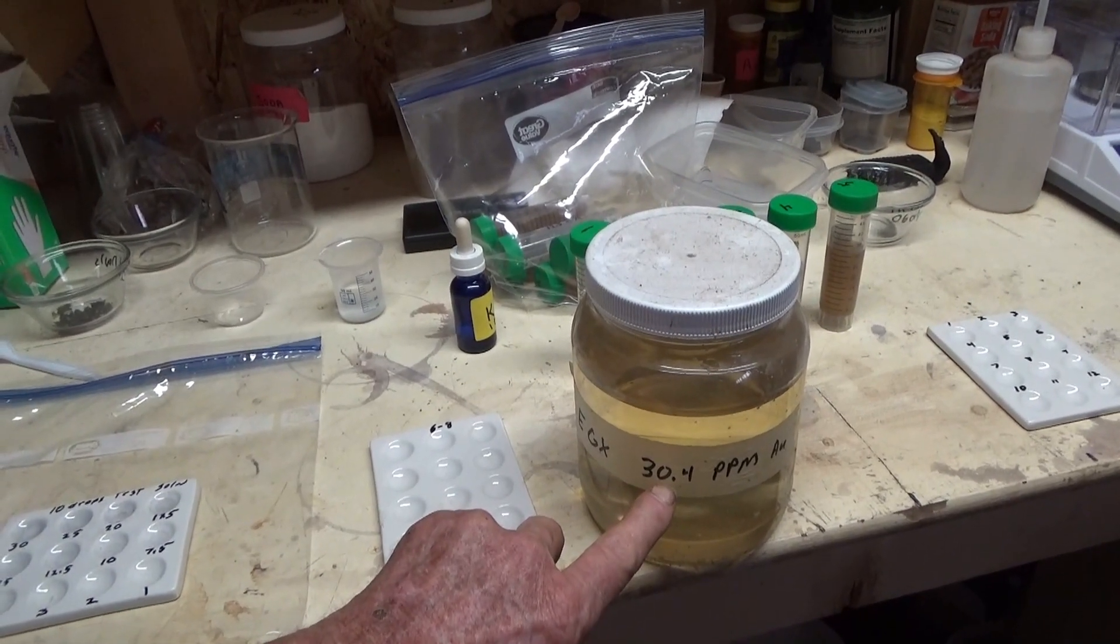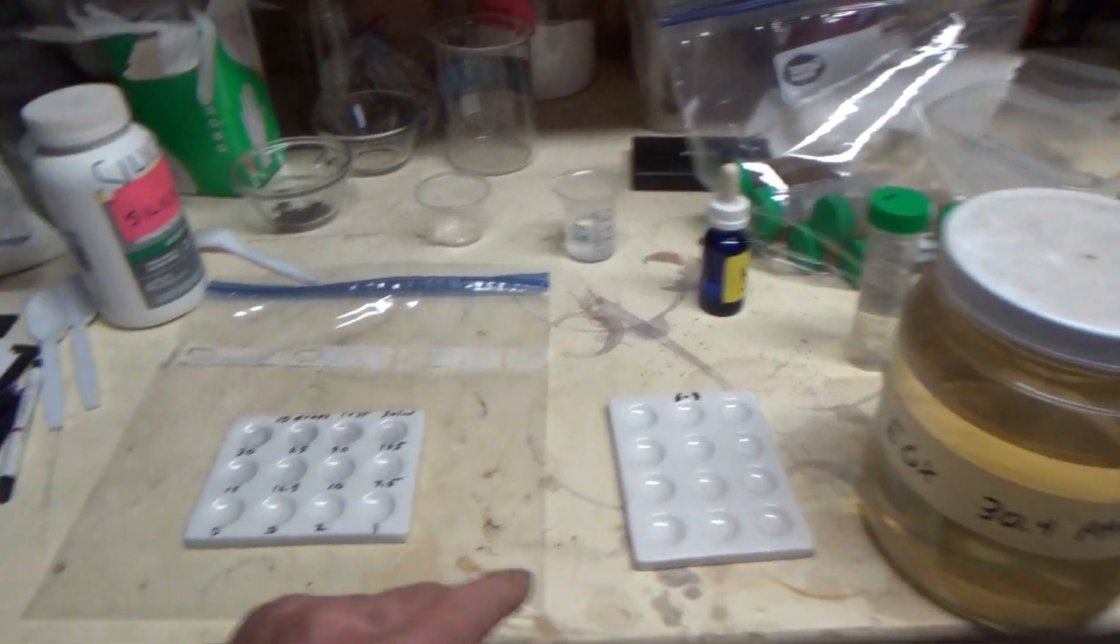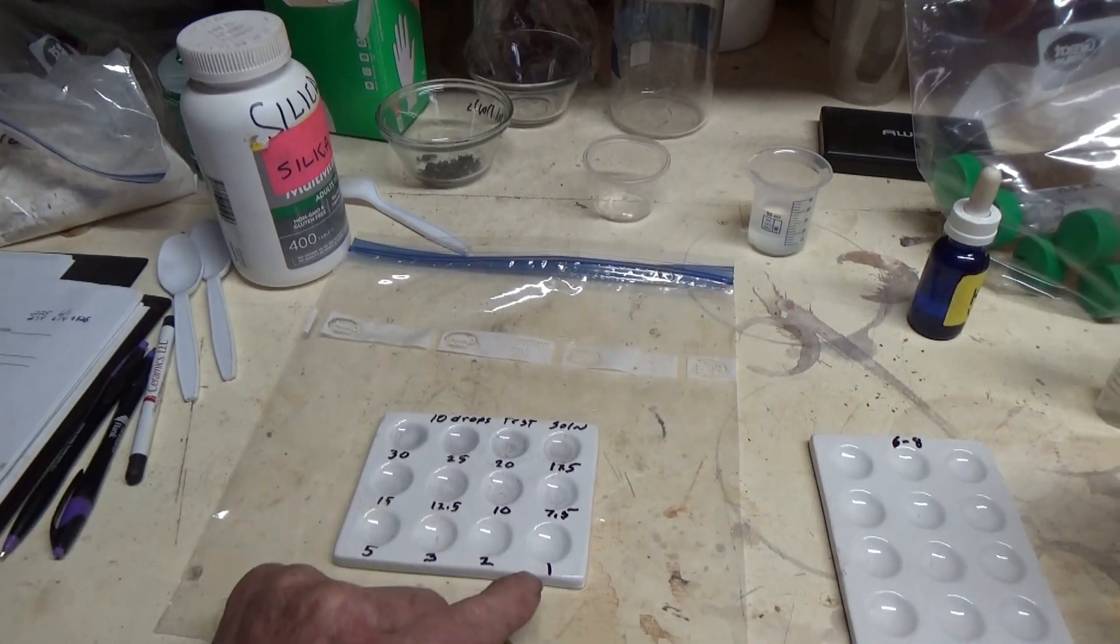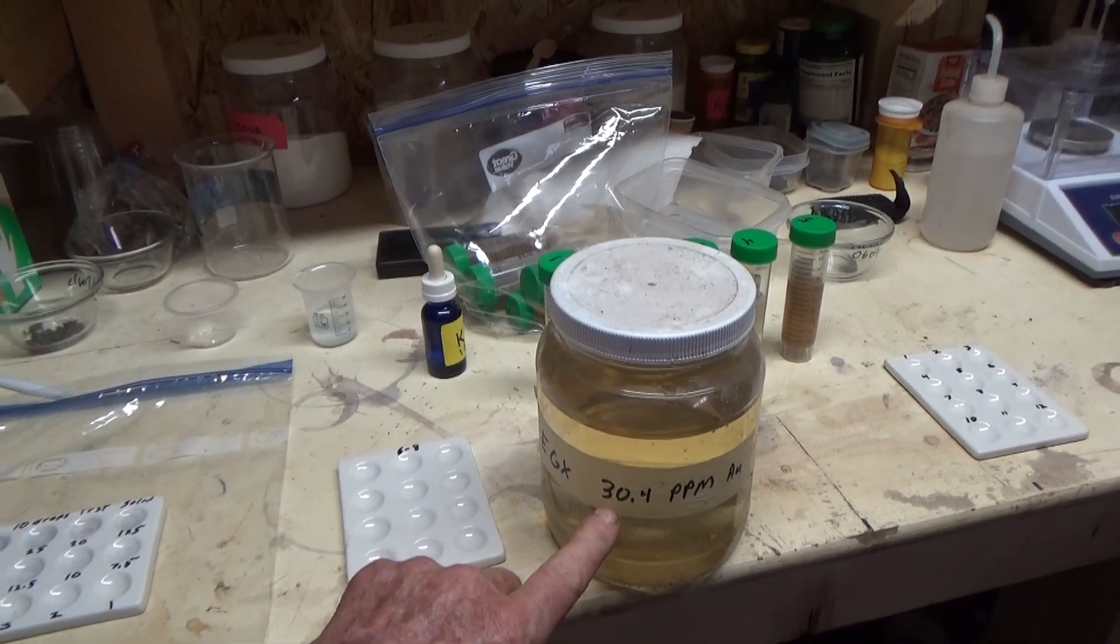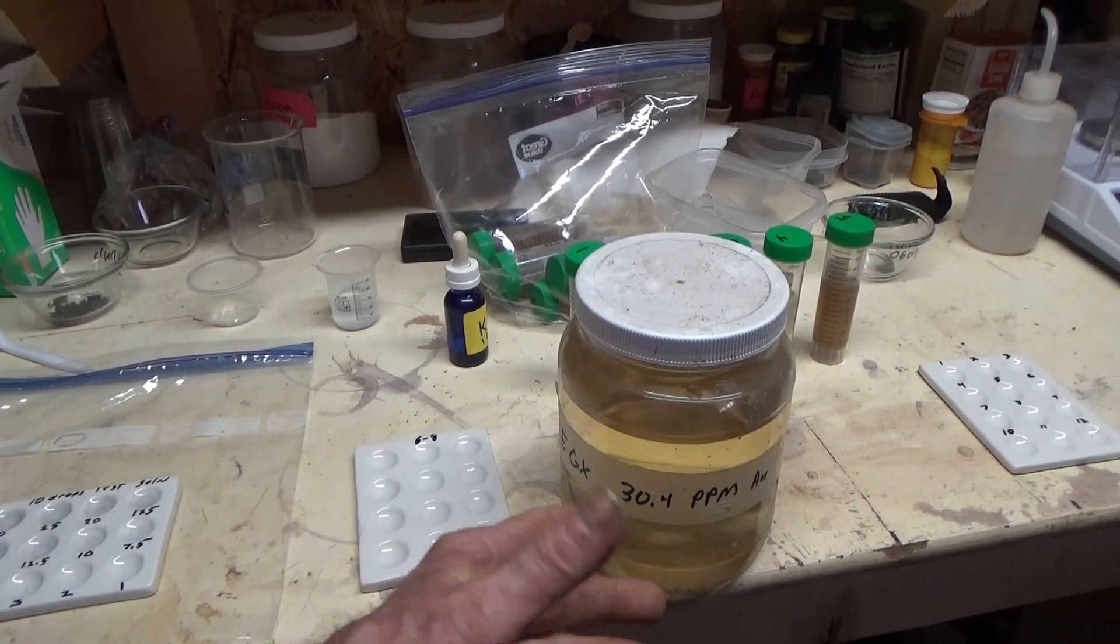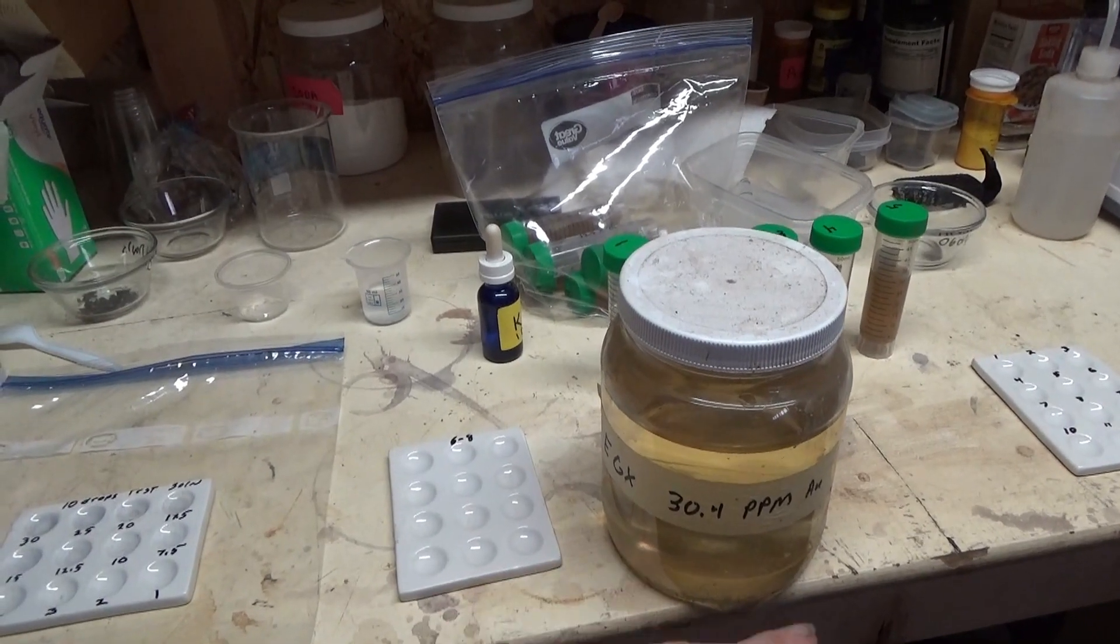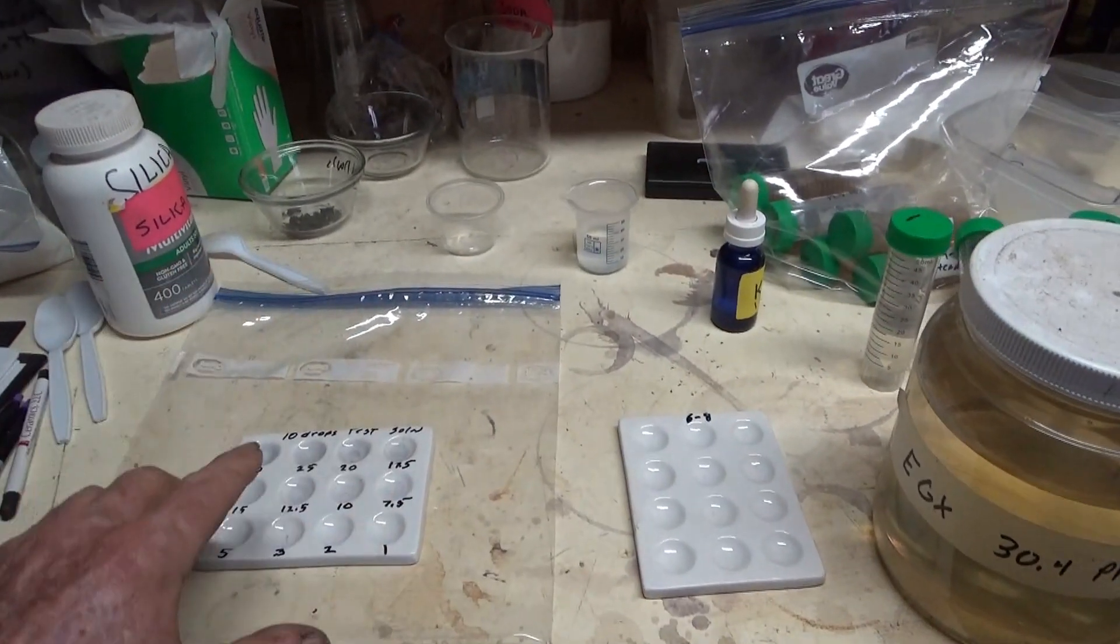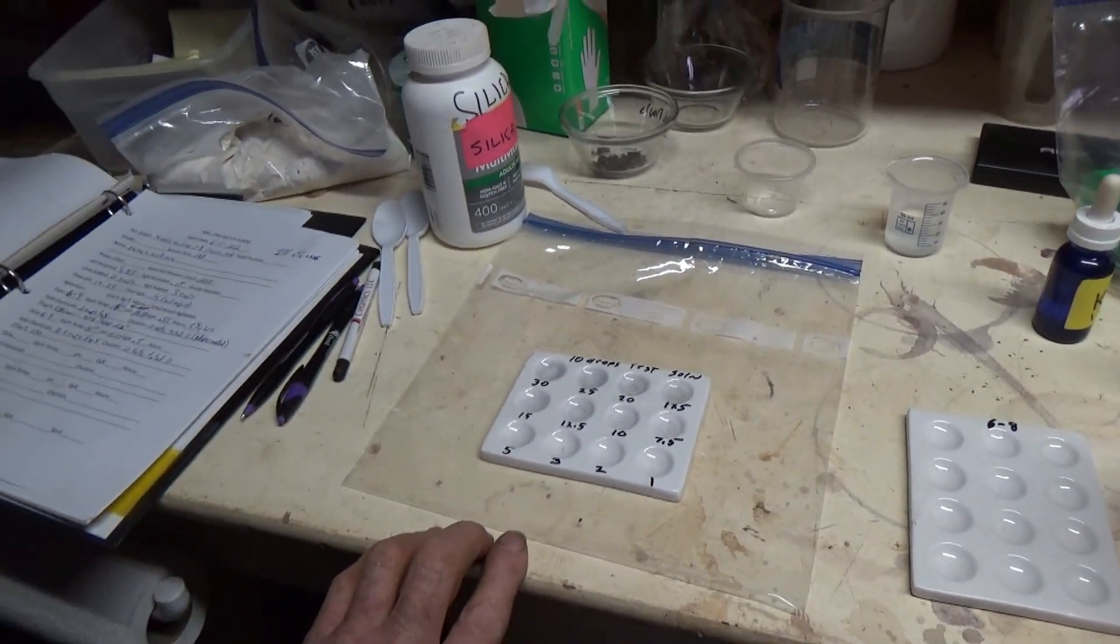You have 30 cc's of solution which is 25 of 30.4 and 5 of water, which makes up a total of 30. Then you've got 25. If you want one part per million, it's 29 of water and one of solution. So basically every drop, every portion of solution per 30 that you put in when you mix the various dilutions will give you one part per million.